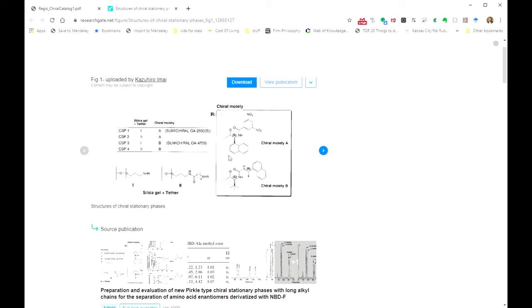So here's a conjugated ring system, so you get a lot of pi stacking type interactions that are going to bind selectively, and it's centered around this chiral center. You're going to get some nice hydrogen bonding opportunities with these carbonyls and that amine. And so the general idea is you look for a lot of functionality that's going to drive intermolecular interactions. It's all situated around some kind of chiral center.